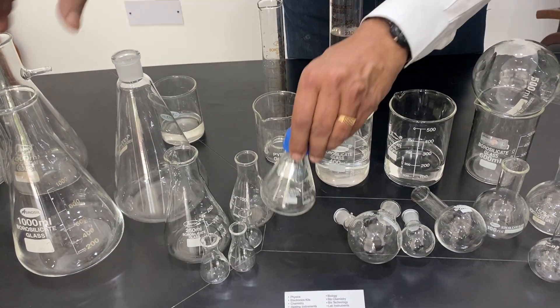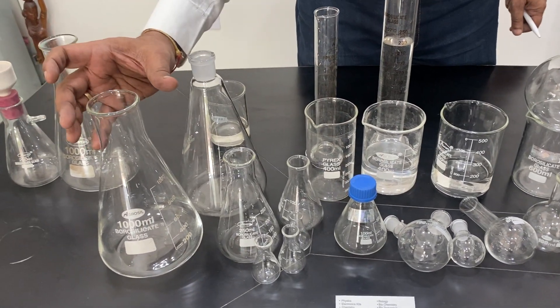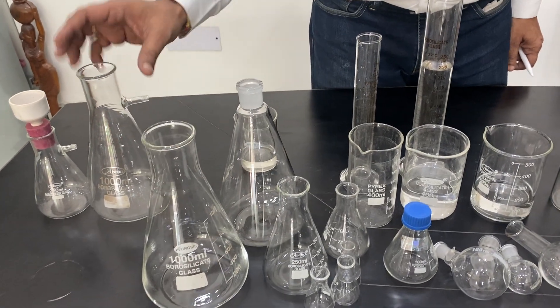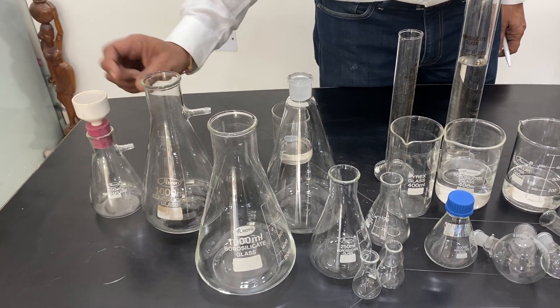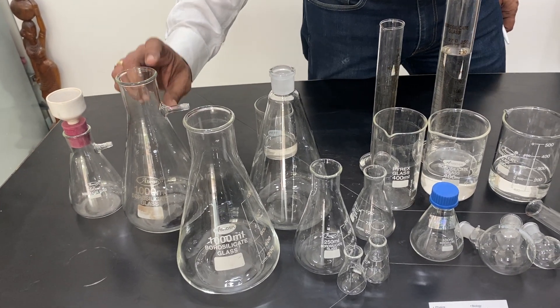Another type is the wide mouth conical flask — some are normal width and some are wider. There is also a bolt neck variant which has a flat surface, and a conical flask designed for filtration where you can filter using the mouth. An adapter-type mouth is also available.